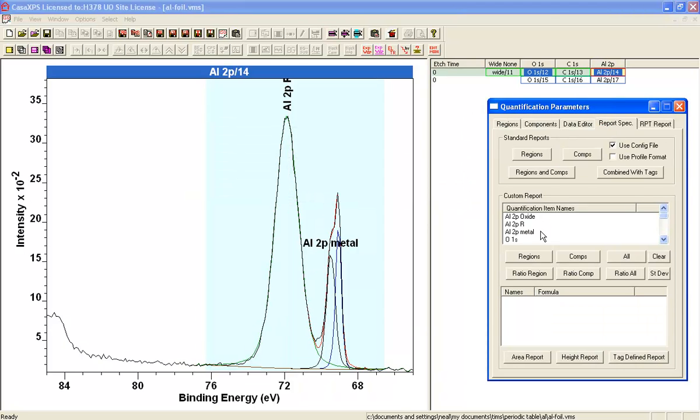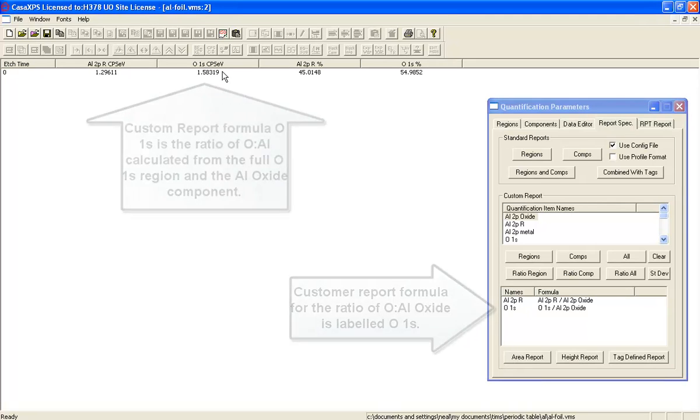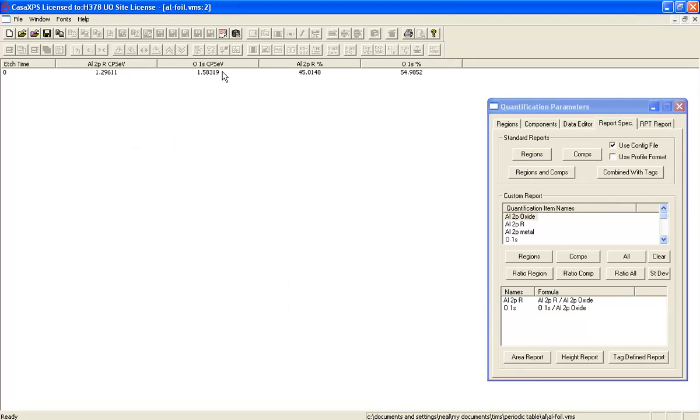and I go to the report spec, I can then look at the ratio of oxygen to the aluminum oxide and use the custom report to do this. And now we see that the ratio is 1.58, so we're getting closer to what we would expect compared to what we had before.